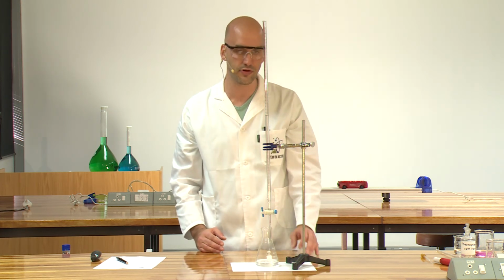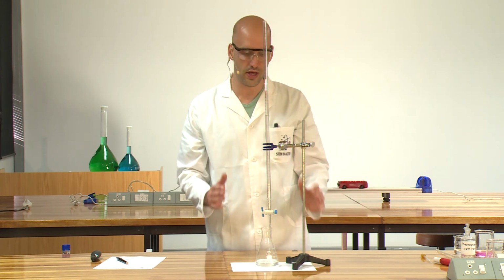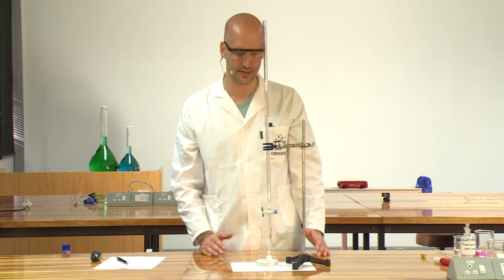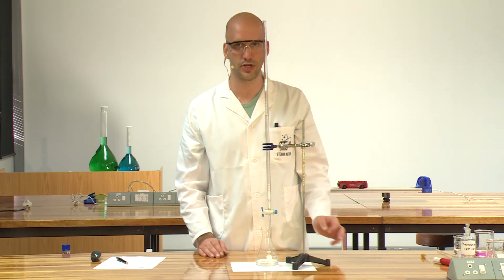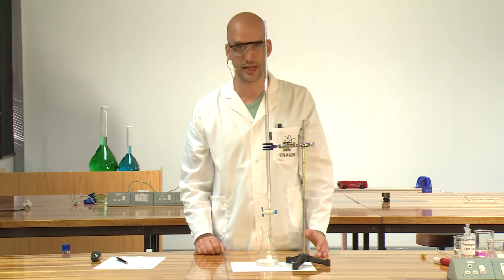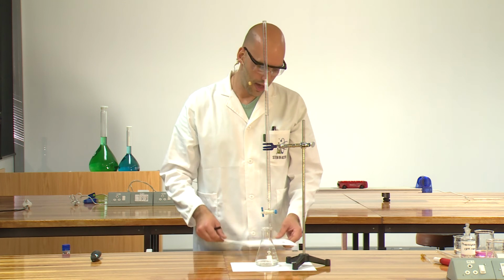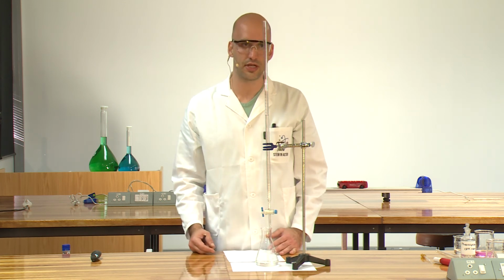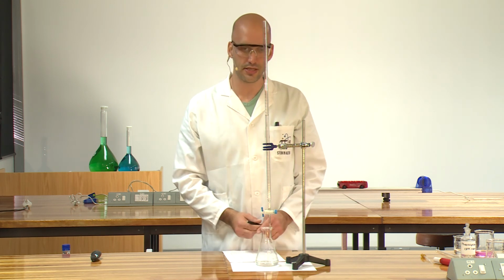Because that color change, if it stays too long, then we slightly over-titrate, and so we're on the edge for that. Okay, I'll show you now when we add 1 more drop or 2 more drops to this, what's going to happen to that color change in there. But first, what I want to do quickly is record all my values that I need for my calculation. We started with the buret.